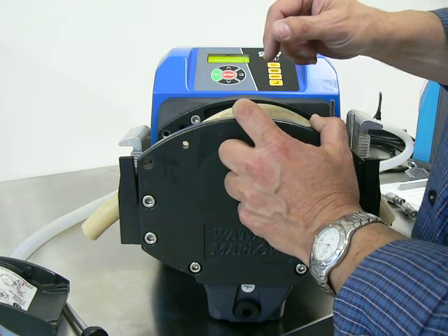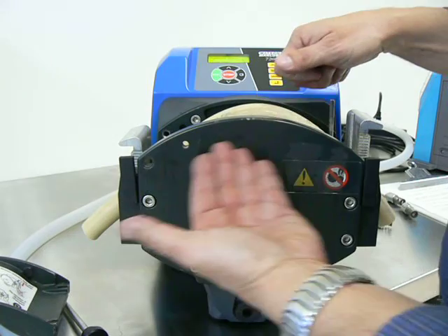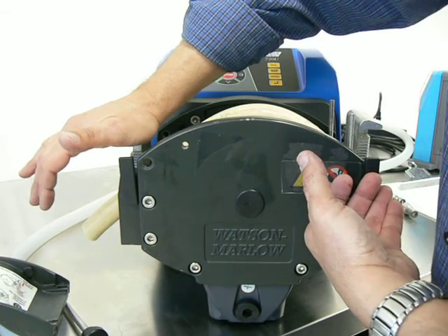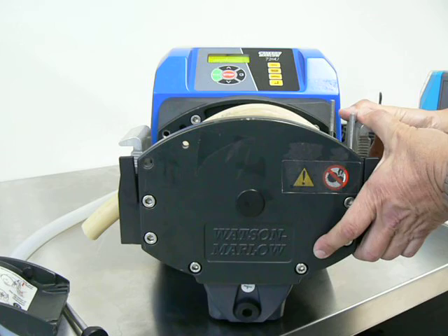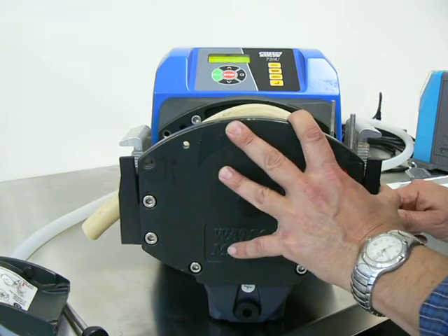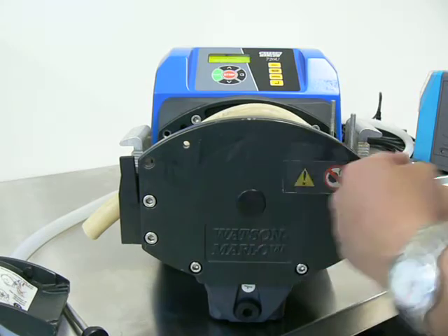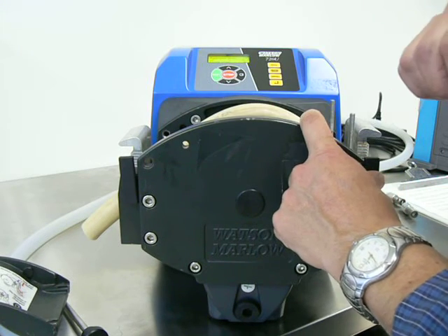The easy way to avoid that is when installing the tubing — again, for this example pumping clockwise, but it can be the other way as well — the suction side you tighten, no tools, just as tight as you can with your hand. The output side you leave a little bit loose, so the tubing has an opportunity to move outward. As the tubing heats up and stretches, it will be able to move out that way, will not migrate towards the gears, and you'll end up with longer tubing life.